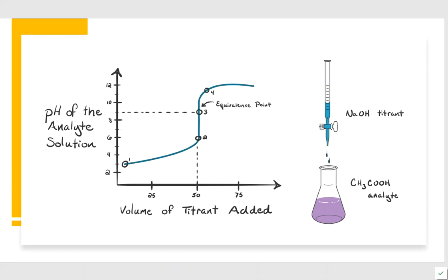So the differences, first, the pH starts a little bit higher because this is a weak acid, not a strong one. But as I add base, drip, drip, drip, drip, drip, I get an increase in the pH up to a certain point. At 50 milliliters, it just so happens to take off again like a rocket ship. And there's my equivalence point. And my equivalence point this time is going to be a little higher than 7. Okay, well, that's normal, but we still see the basics that are present, and that's what this is all about.